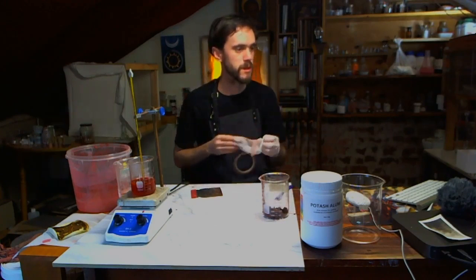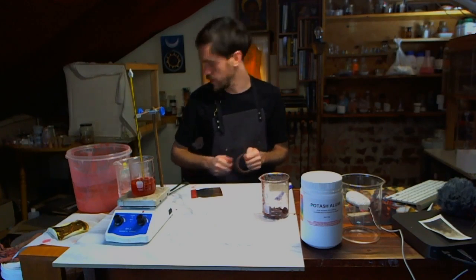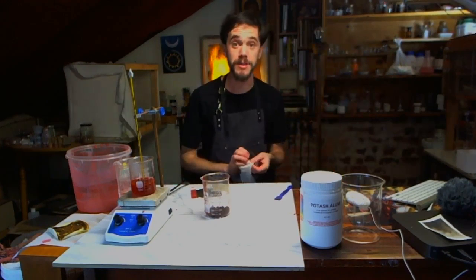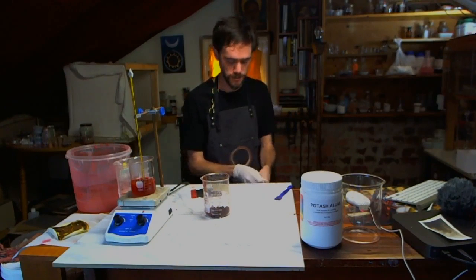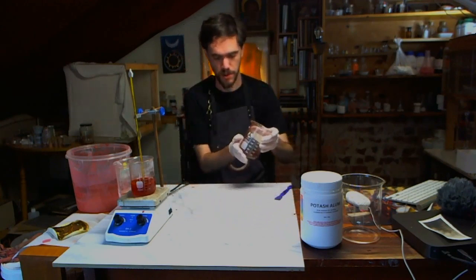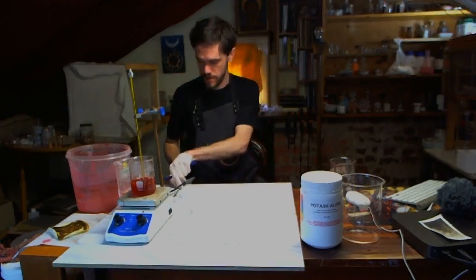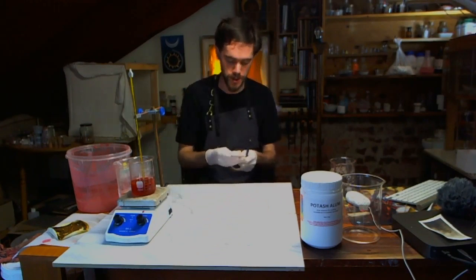Might change gloves because they're covered in stuff. Yeah, I think if I did the acid wash step at a higher temperature with sulfuric acid and really made that, then we might get a better yield, but again, as I said the other day, I'm not super keen on boiling sulfuric acid at this point in time. We'll get there, but I just haven't quite put the energy into setting up a safe setup to do that yet. And working in the home amateur lab here, there are limitations to what I can do safely.